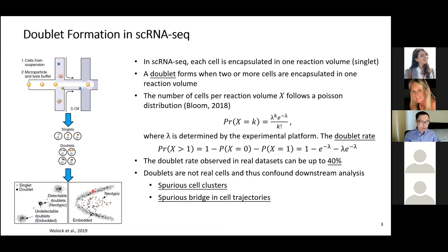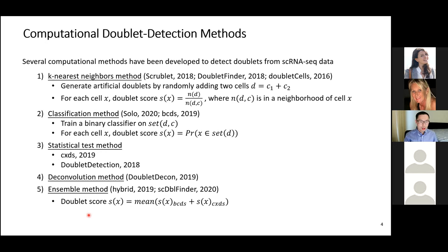This example illustrates the bias in cell trajectory analysis. Ideally we observe two trajectories in our sample, but due to the existence of doublets — which contain a combination of gene expression from two cells — we observe a bridge connecting the two branches, which falsely leads to the conclusion that there is actually a third branch. Therefore, removing doublets is very important.